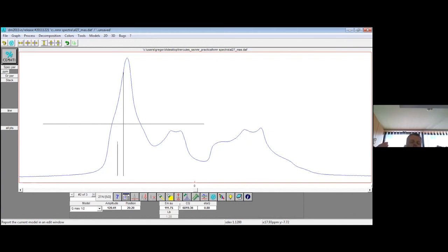And then when you have the spectra and you have the assigned signals in the spectra, sometimes this is enough, sometimes you start to manipulate the sample, treat it somehow and see what changes in the spectrum. And because you know that the peak that was shifting belongs to this nucleus, you say, okay, something is going on at this position in the crystal or so.